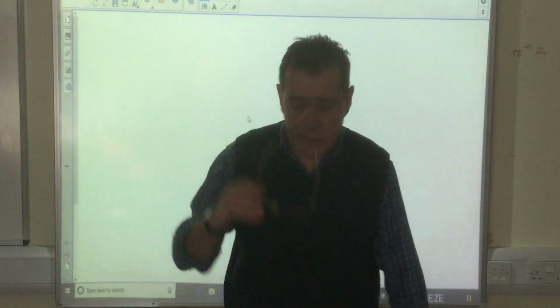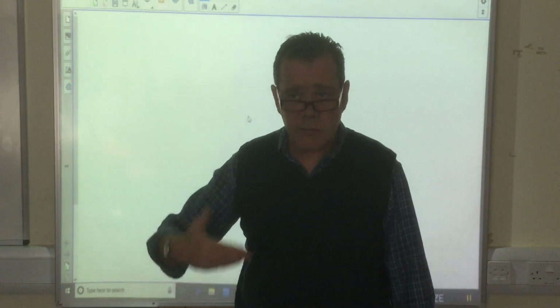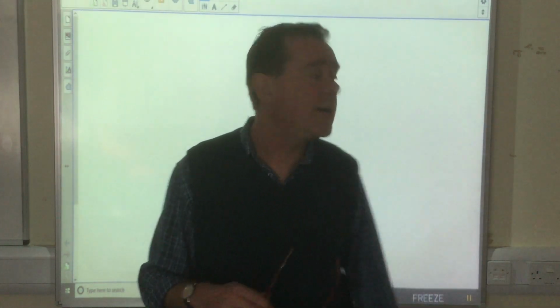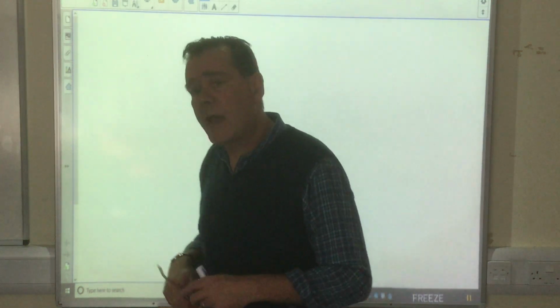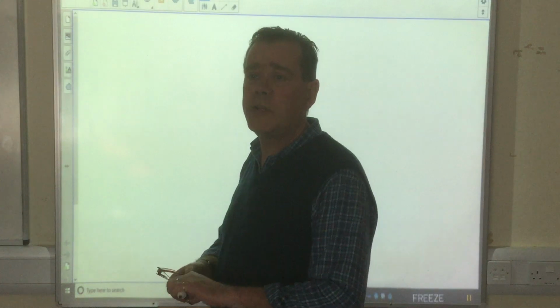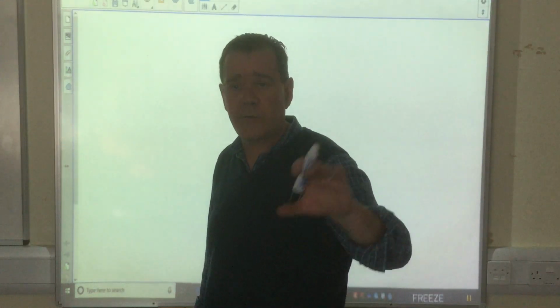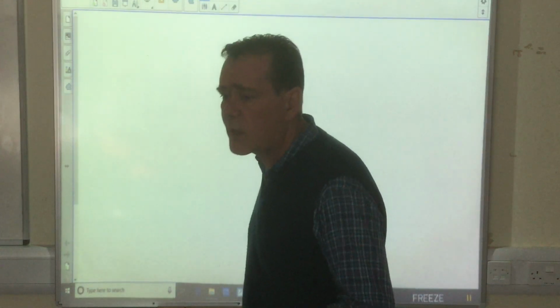Now, I'm going to do a PAG with you to prepare a haloalkane. So I'm going to show you some practical techniques as well. This is a virtual experiment, if you want to call it that. All right, guys? I want this copied down, I want this written out. I don't want you to just watch the video. I expect to see this all copied out nicely, and enhanced with anything else you can find from other videos, because there are experimental techniques in this that we need to look at.